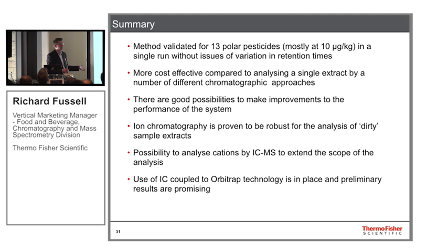And also the results, at least for glyphosate, AMPA and glufosinate, also look very promising. And it's quite easy to switch between LC and IC. So if you've got an Orbitrap system or a triple quadrupole system, it's quite easy to connect an IC system to those mass spectrometers.